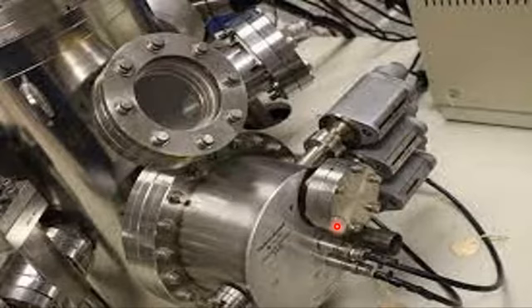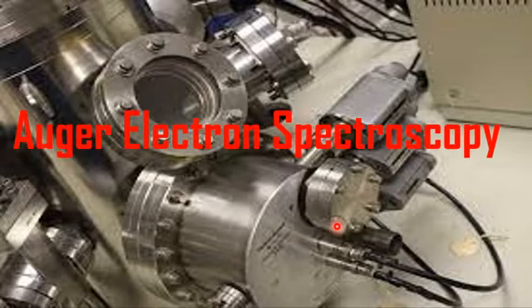Today we are covering one of the special topics about material surface characterization, and that topic is known as Auger electron spectroscopy. Auger electron spectroscopy is a technique which determines the presence and amount of a material as well as the element.